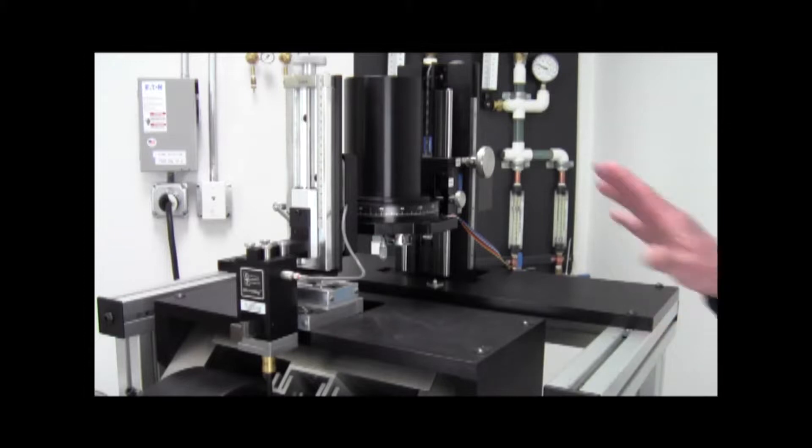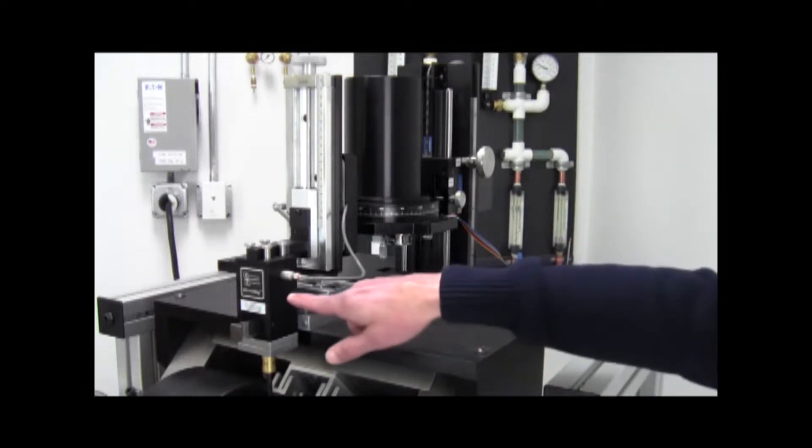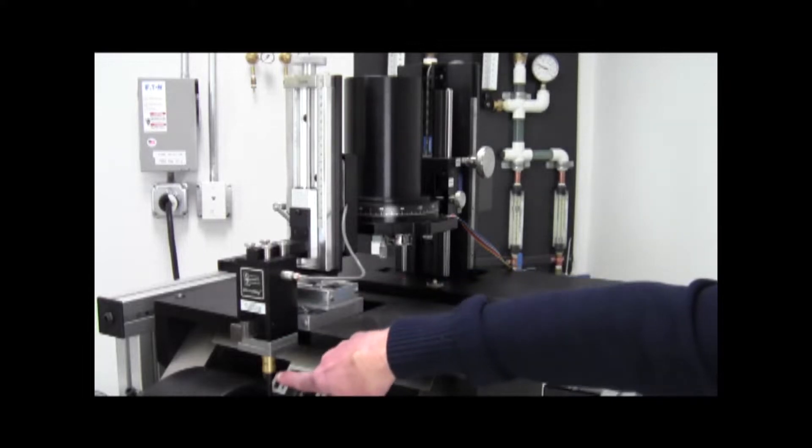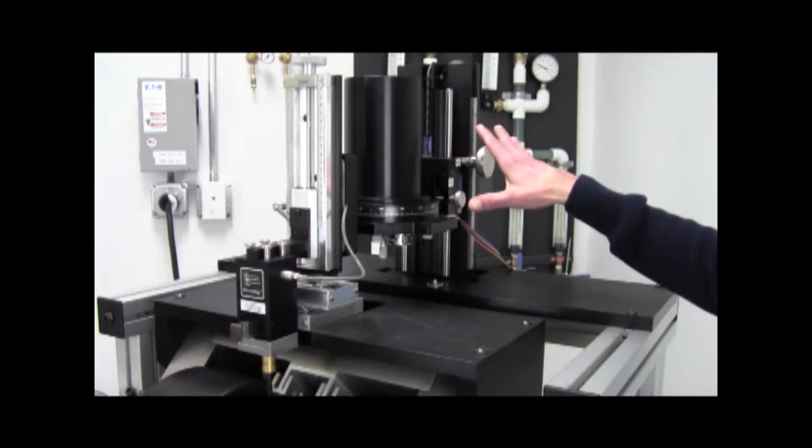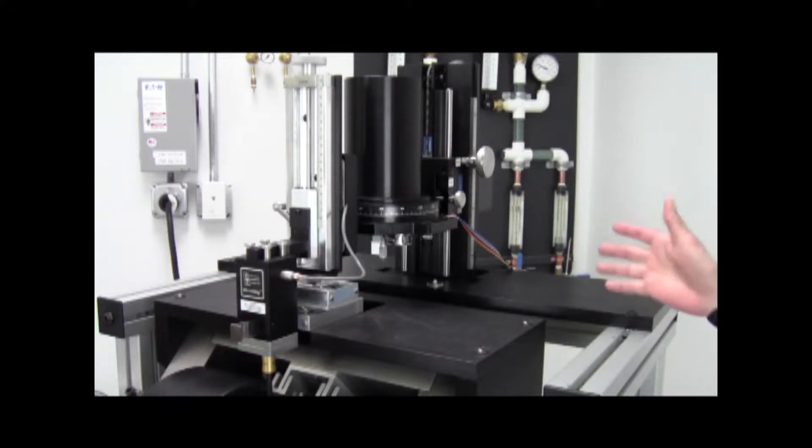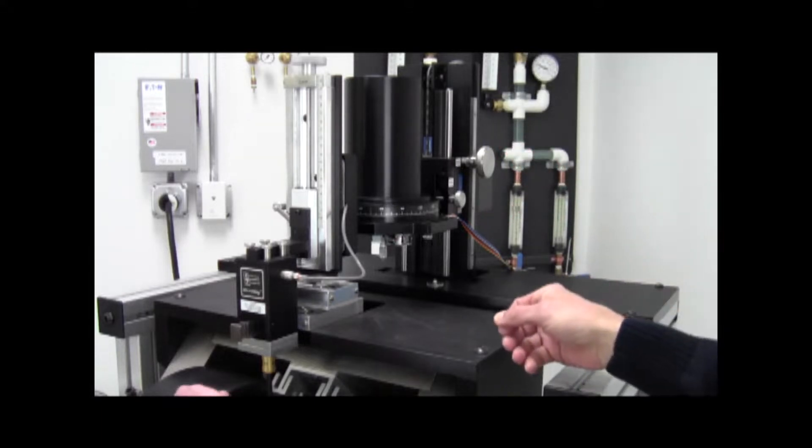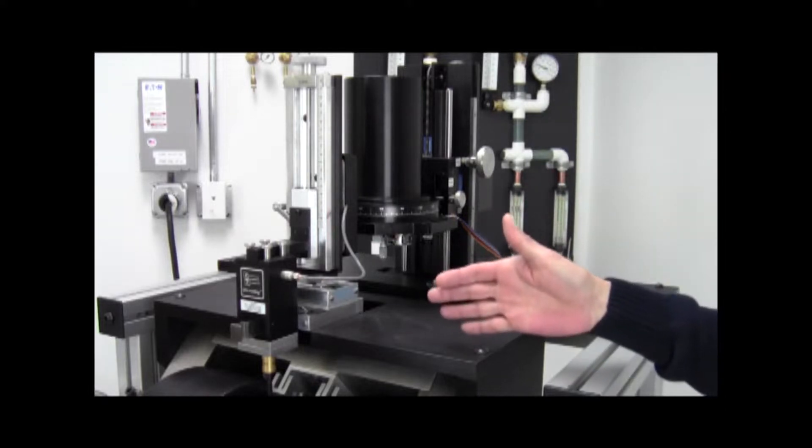This combination system right now is configured as an AGM. So this is the AGM head, this is the AGM probe. The VSM head is shown in a parked position here. To convert between an AGM and a VSM, you simply remove the AGM head and slide the VSM head into place.